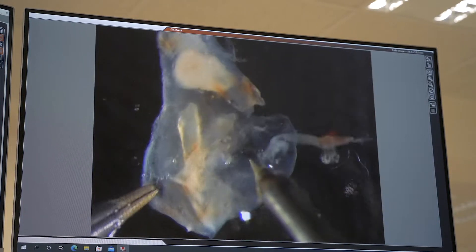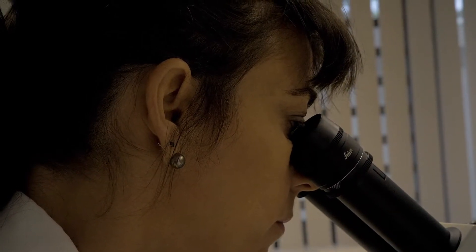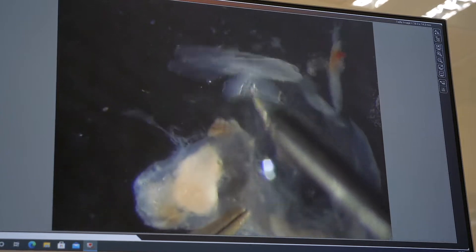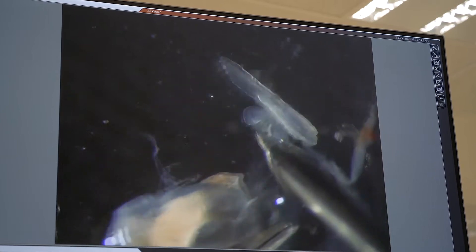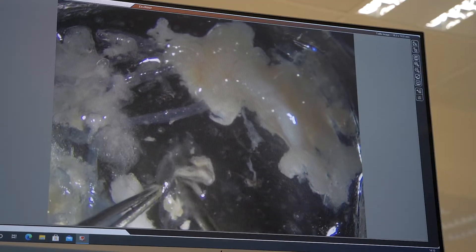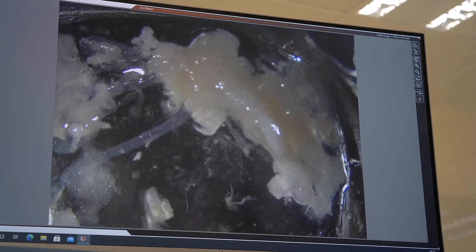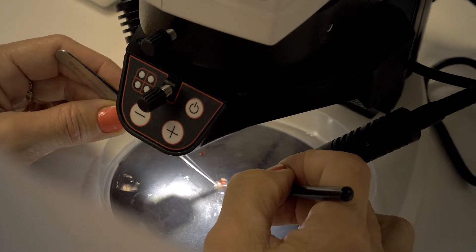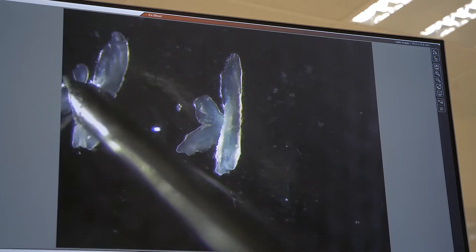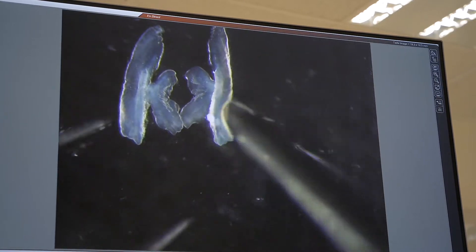As you can see, during my extraction I have found the otoliths and I don't need to search for them within the capsule under the microscope. Sometimes you need to spend some time to find the otoliths. We need to be very careful when removing the otolith because it could break. I use pointy tweezers to hold the membrane and a small needle to break the membrane. I can push the otolith with the needle.